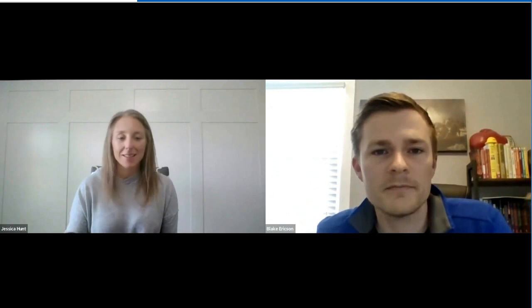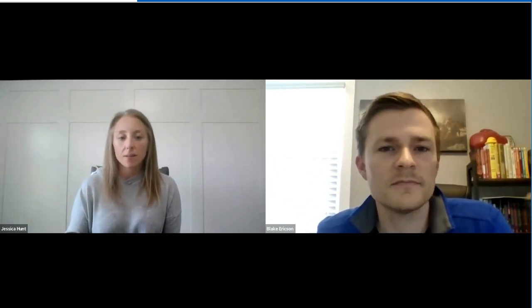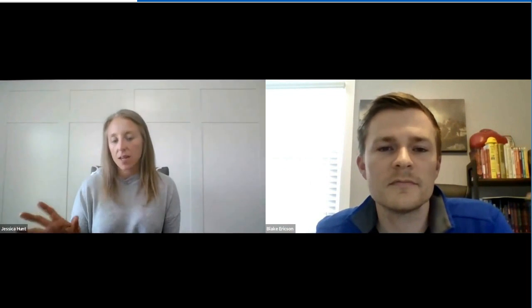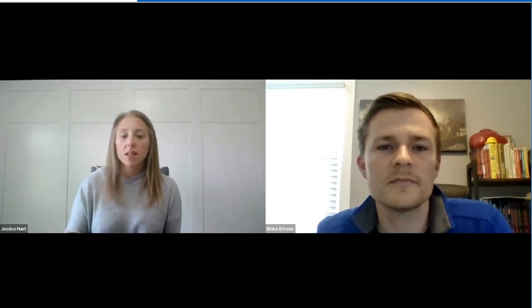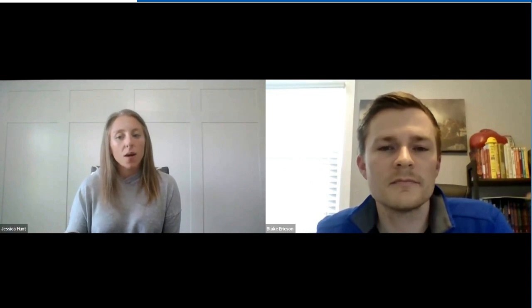Excellent advice. Now, there are a bunch of FTIR brands in the market that can provide low detection limits needed for the new formaldehyde rule. I've heard about 3 during this webinar, but one is not sold anymore. So can you talk a little bit about that?